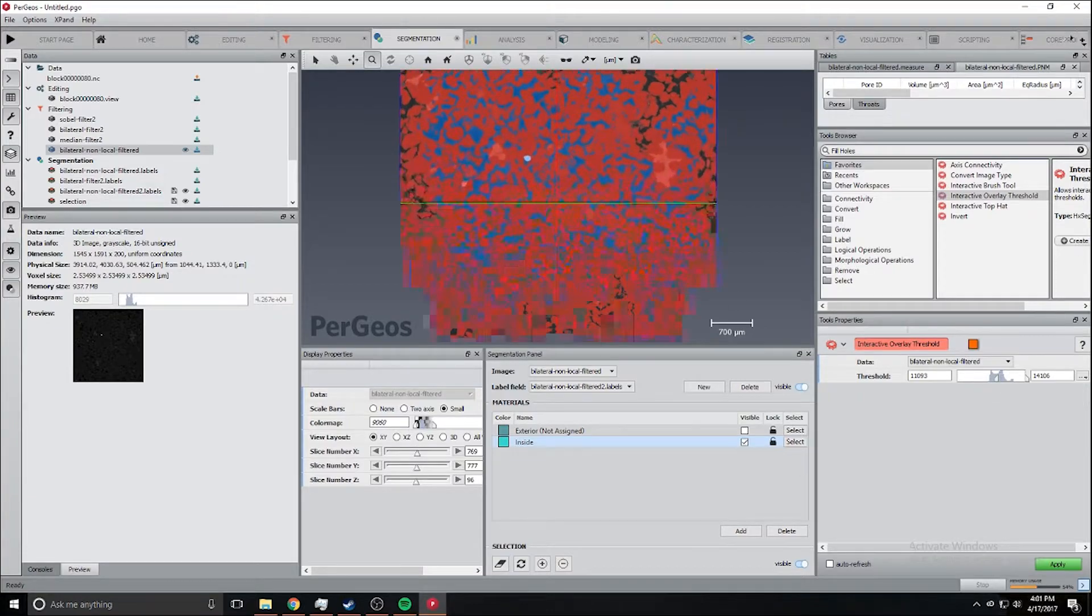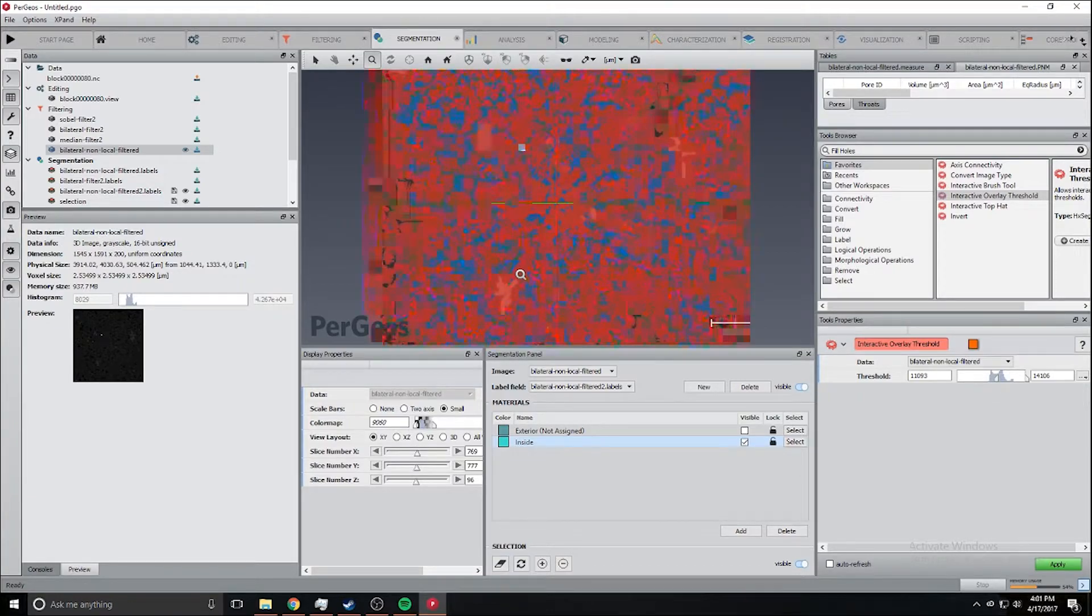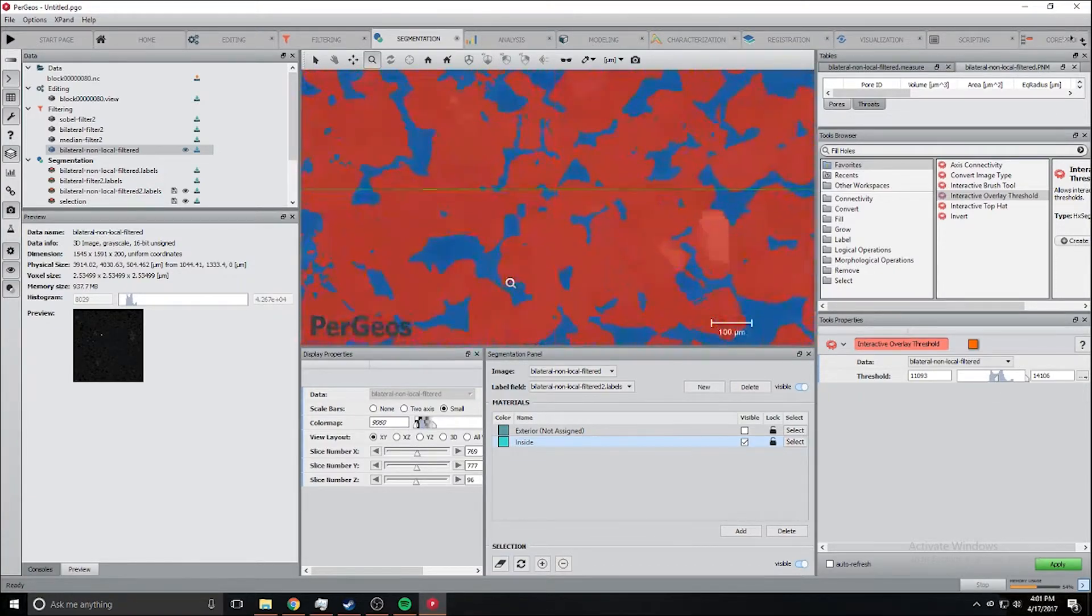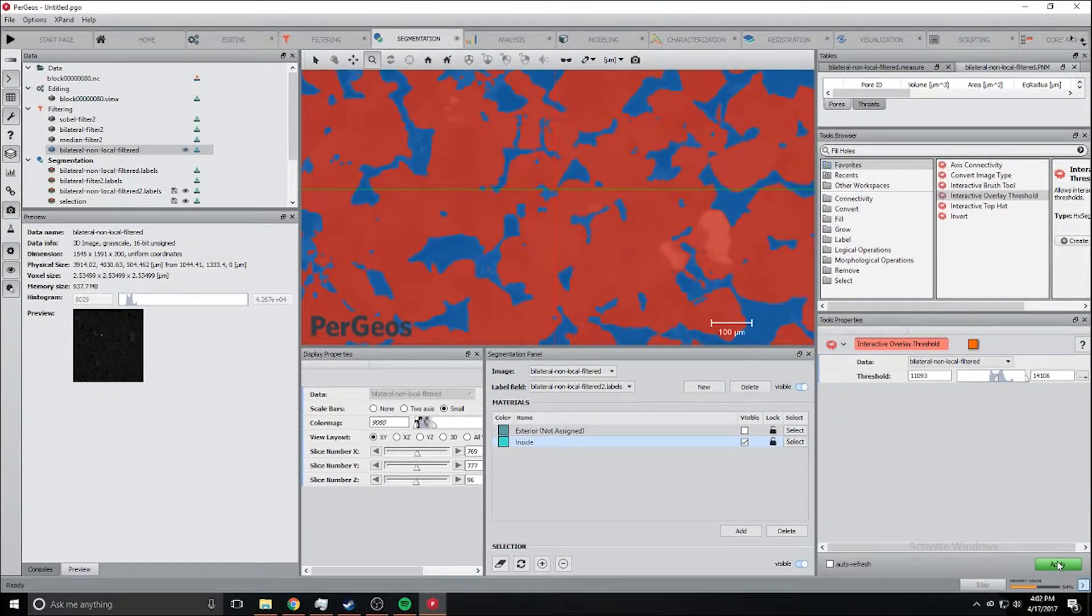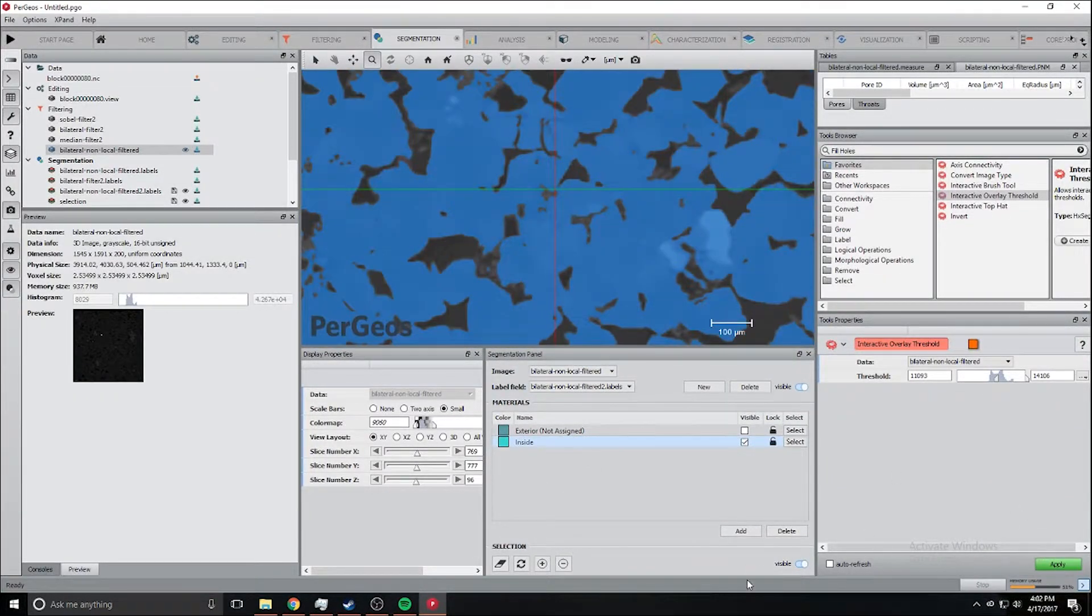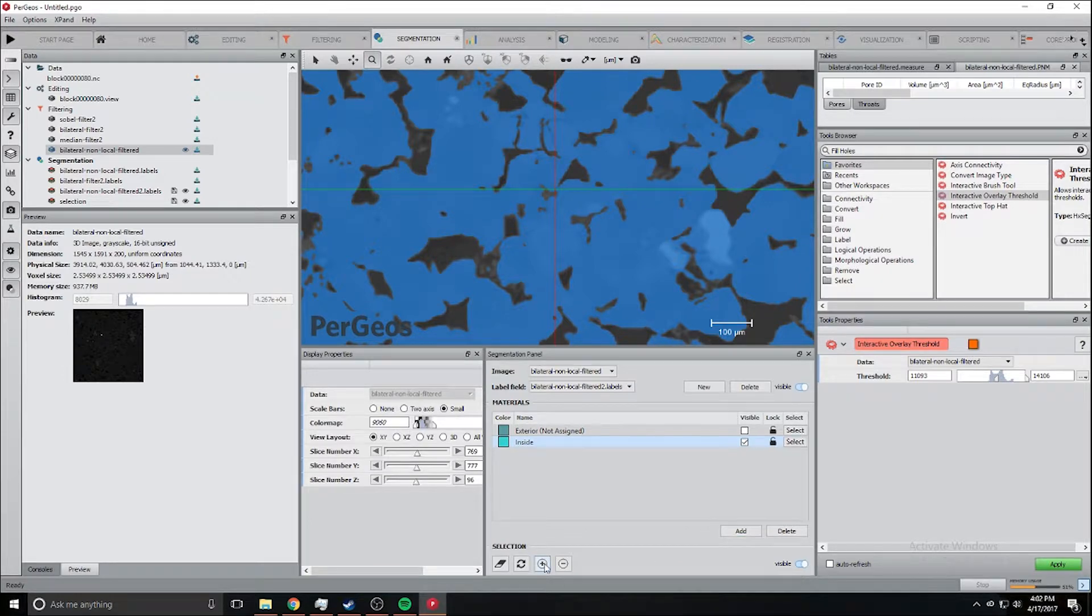Zoom to range. That looks better and we're going to click apply. That looks good and we're just going to add that to the inside.